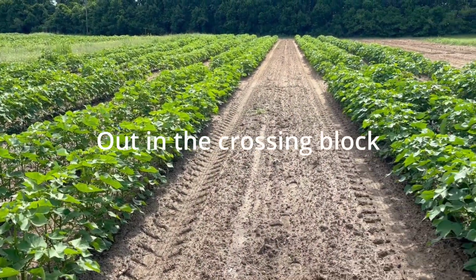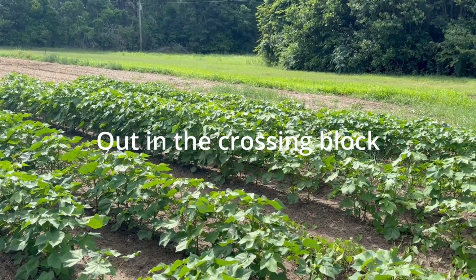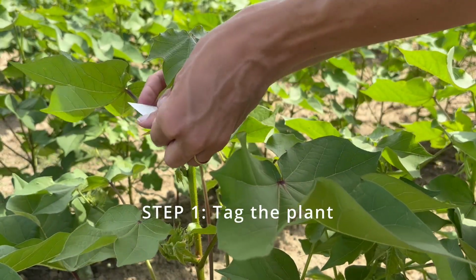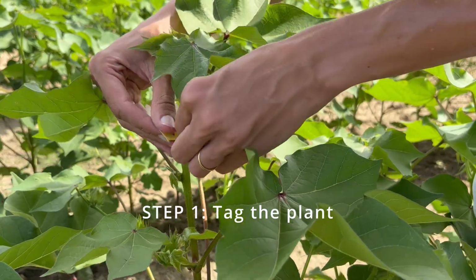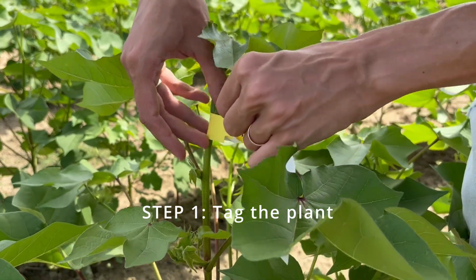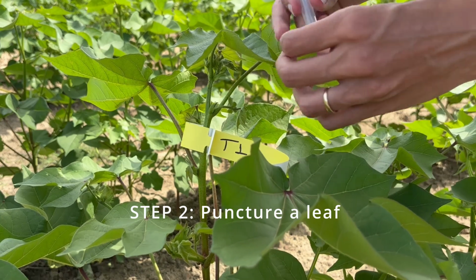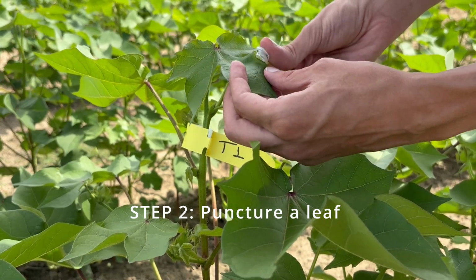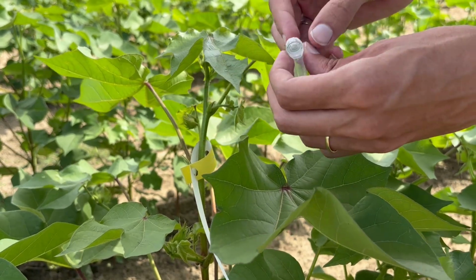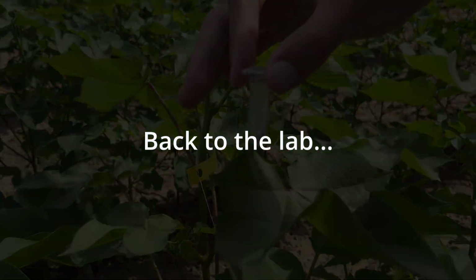After we gather our materials, we can head back out to the crossing block, where selected genotypes for crossing are planted. Our first step is to tag our plants. The bright tag helps us identify the plant easier in the field when we come back to do the crosses. The next step is to puncture a leaf using the microtube itself to collect tissue. The sample should look like this. And we're done in the field, so let's head to the lab.